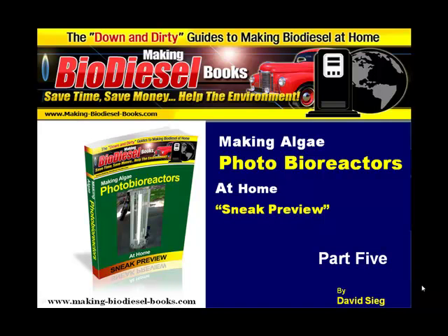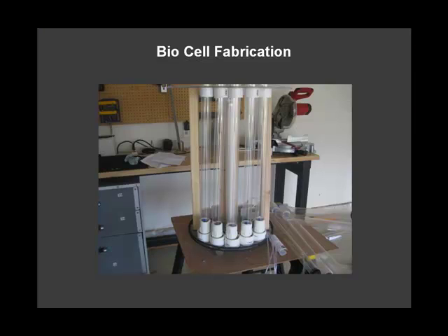Hello and welcome to part 5 of making algae photobioreactors at home. First we're going to start with the biocell fabrication today.